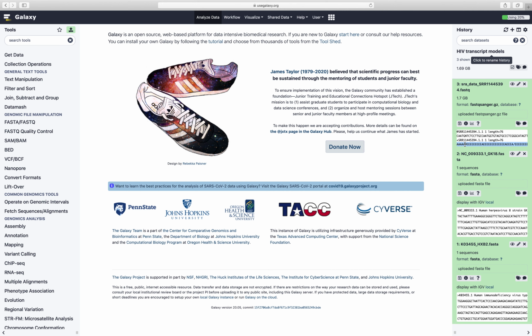I'll talk about quality scores in another discussion, but this basically gives you an idea of how much the sequencing technology believed that, for example, the first base in the sequence was a C, or whether or not the second base in the sequence, which is an A here, is really an A. These symbols do not directly correspond to this. These symbols are based off of a different type of coding scheme that we'll talk about.